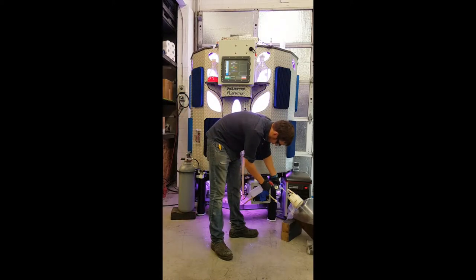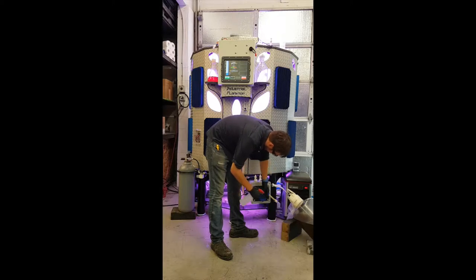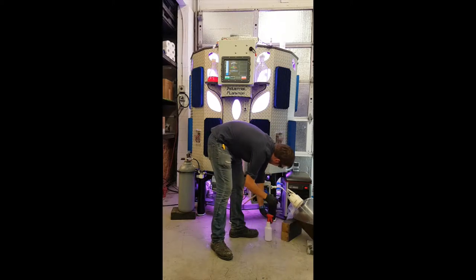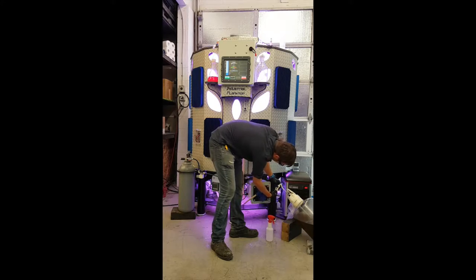We've got everything sanitized over here. I'm going to spray the face with ethanol on both of these quick disconnect fittings. Press them together and make sure the line is not kinked.